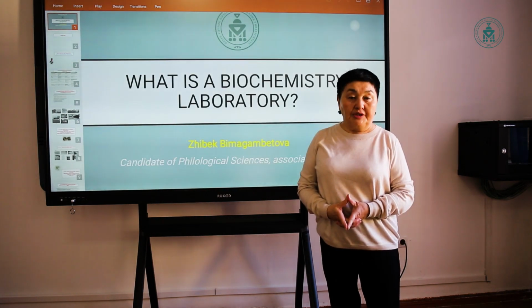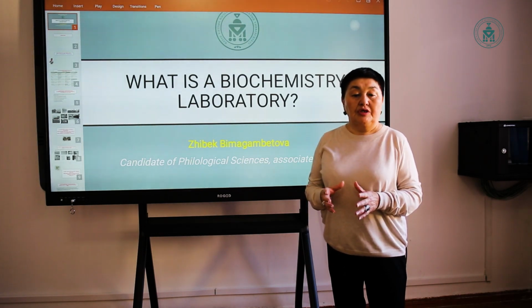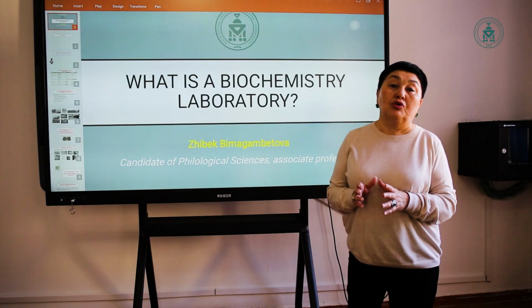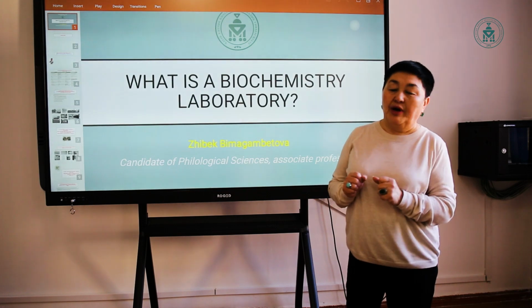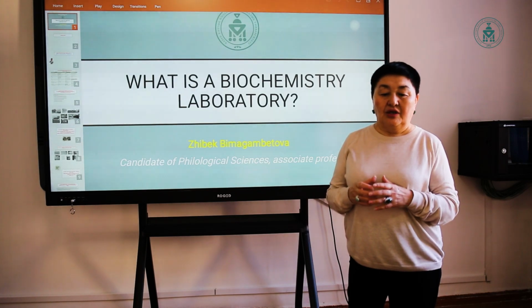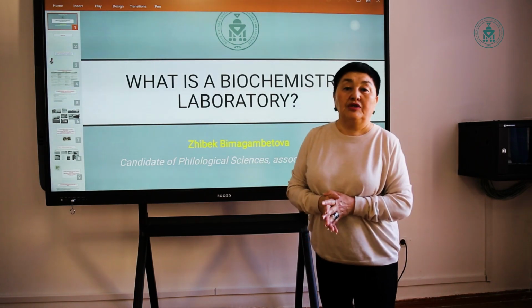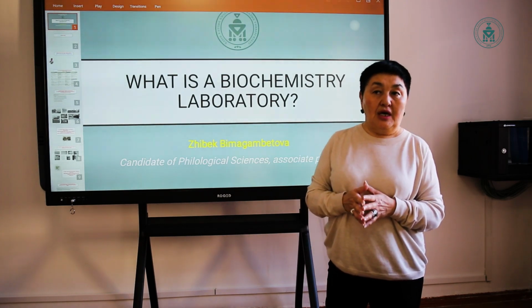The second objective of the lesson is to teach students to familiarize themselves with essential laboratory equipment and specialized tools used in biochemistry research, fostering an understanding of their significance in scientific investigation. So we continue, usually, with reading the text about different laboratories.